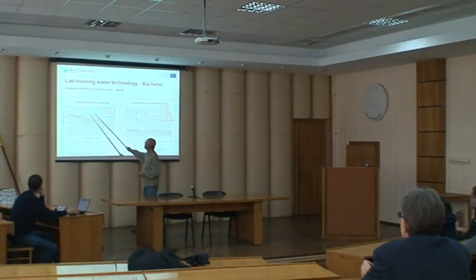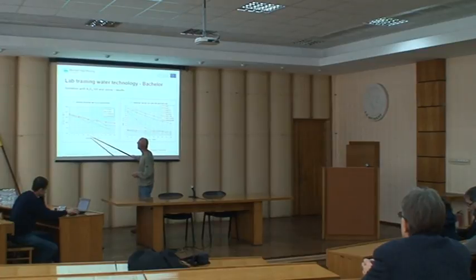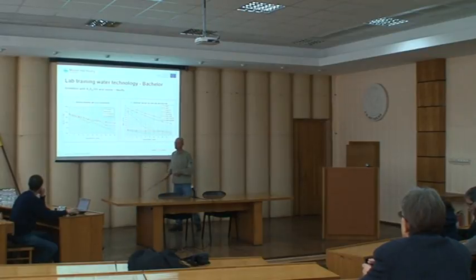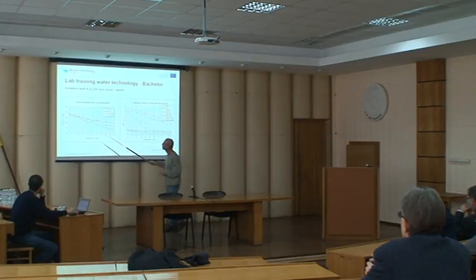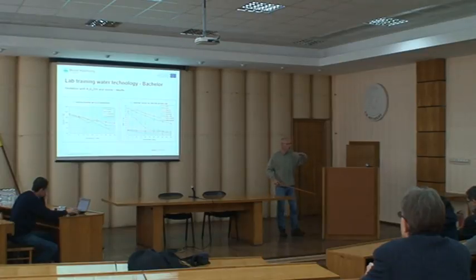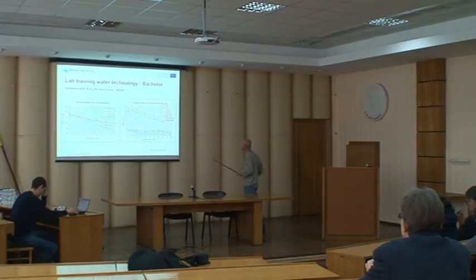So here you can see the time axis again and the concentration of H2O2 in the solution. So you can do a good determination of your substance directly, or you can say, okay, what's the start concentration of H2O2, and if H2O2 is being used for an oxidation process, the concentration decreases, and thus can be recorded over the time as well.